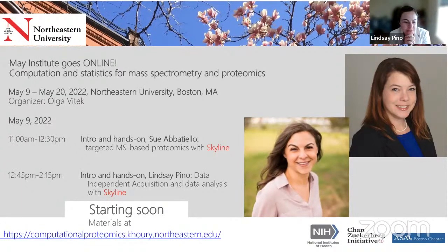If you stayed with us this whole time, we had a little bit of discussion during the middle, tried to get to some of your open questions from the first half. I'll also try to do a little bit of a review from the first half, at a higher level, since we gave you a ton of information. The point of that is not that you should know every piece of that inside and out, memorized from the heart.